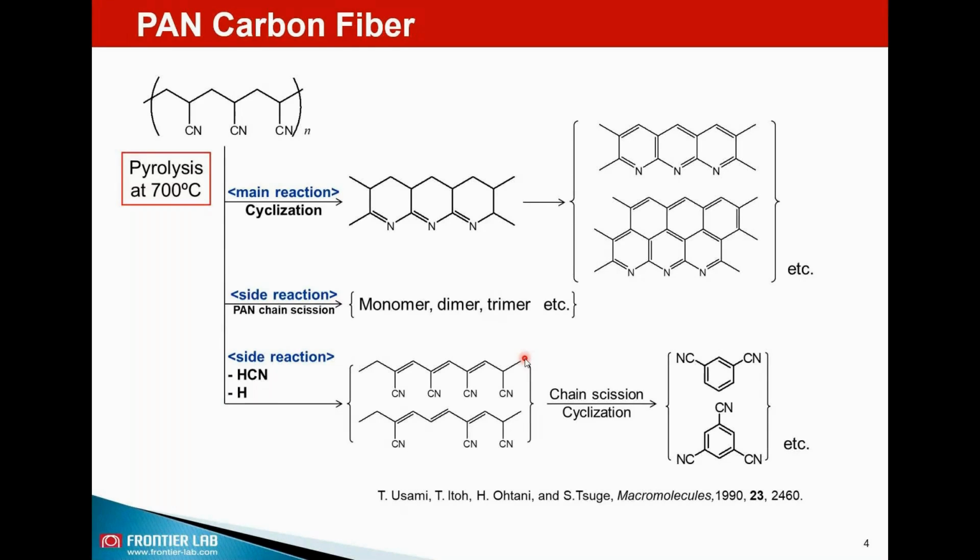During cyclization, a condensation process also releases some hydrogen cyanide and ammonia. Our idea is to look at this product distribution to understand the stabilization mechanism and how one can use PYGCMS to optimize the stabilization or manufacturing process.